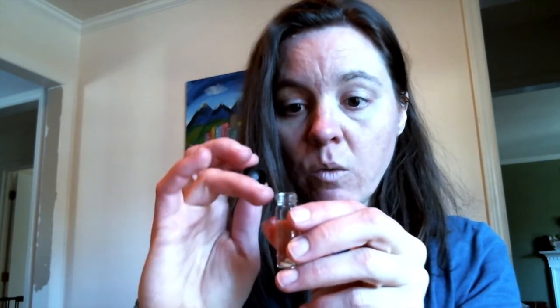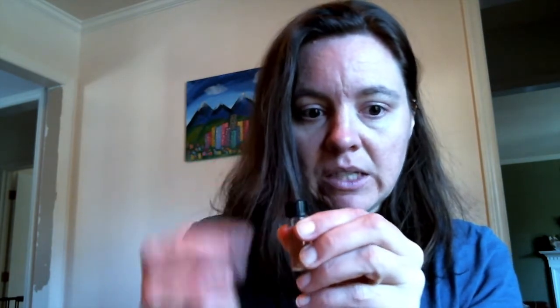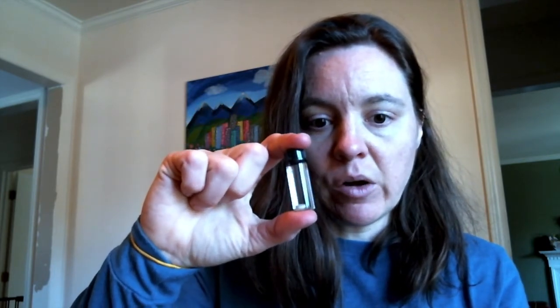Okay. And then I'm going to put the cap back on very tightly. The water level is all the way up here at the top, so there is going to be a little bit of spilling as I put the cap back on. And then it says to mix. So I made sure that there are no air bubbles in there. My cap is on very securely. Then it says to mix by inverting the tube over and over, about 1 inversion per second, until the tablets have disintegrated. This will take about 4 minutes.